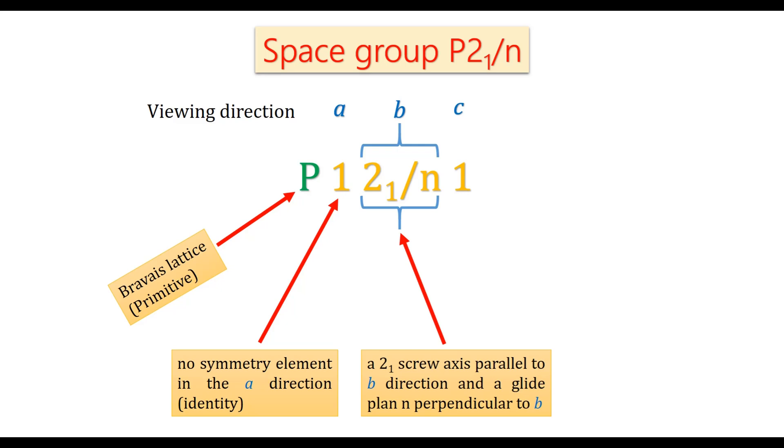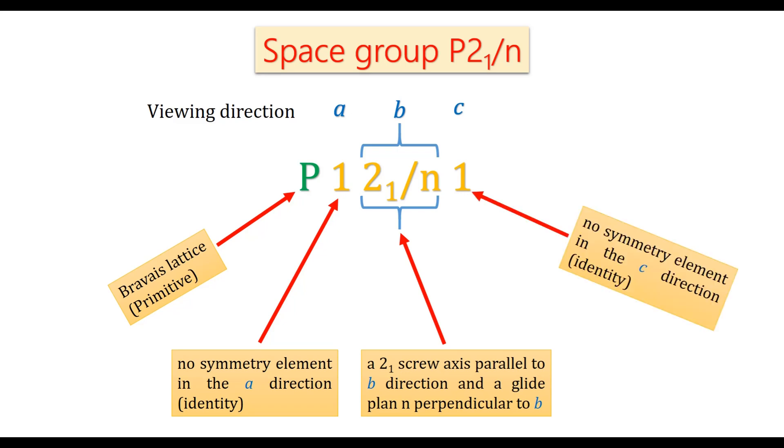In the direction of b, a 21 screw axis parallel to b direction and a glide plane n perpendicular to b. And again in the direction of c, there is no symmetry element, so it is identity.